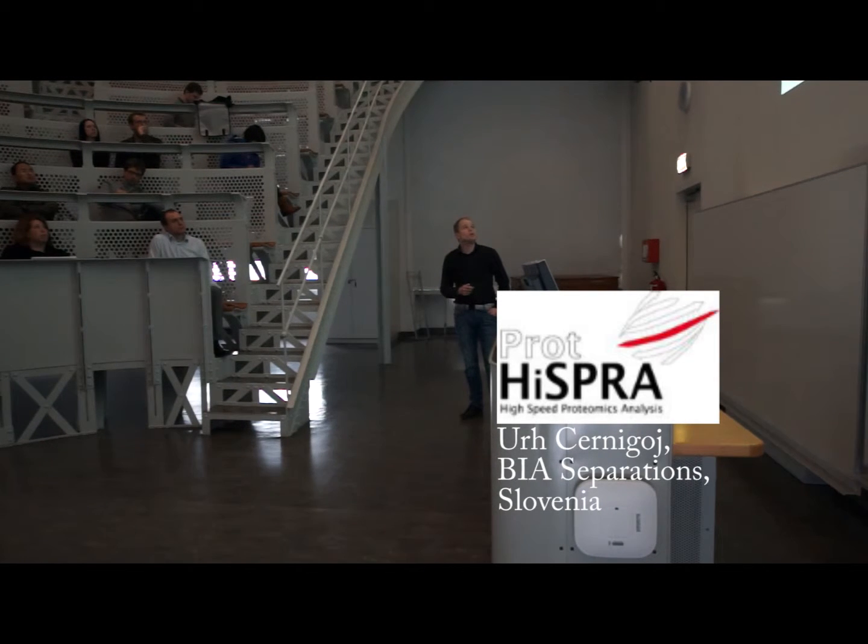We were able to obtain the monolith, with proven titanium dioxide inside the structure, but still it was not a really homogeneous structure, and we then slowly focused more on the other approach of preparation of titanium dioxide monoliths, in the way that we took the monolith as it is and we immobilized the nanoparticles on the surface of the monolith.